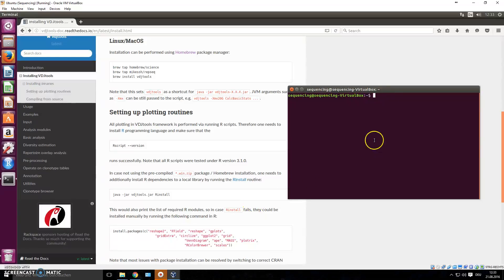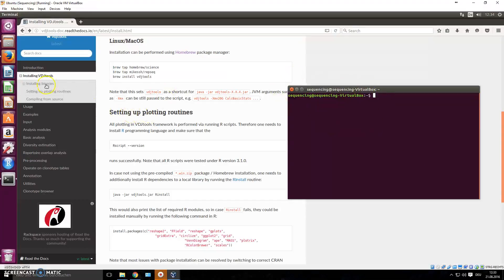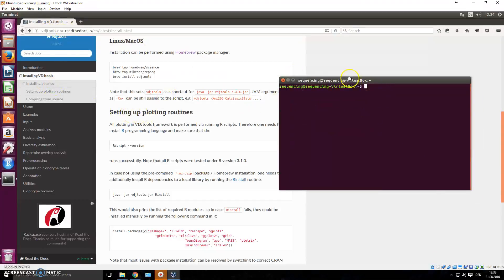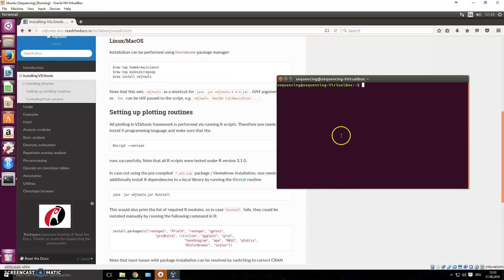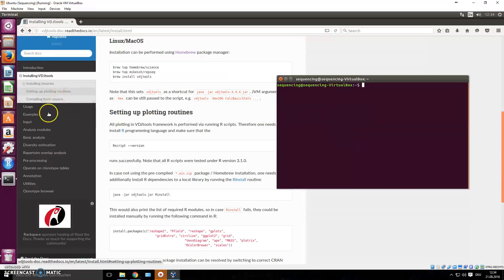Hey guys, welcome to another video on next generation sequencing data analysis. In the last video we installed VDJ tools, and in this video we're actually going to start using it on our sequencing data.